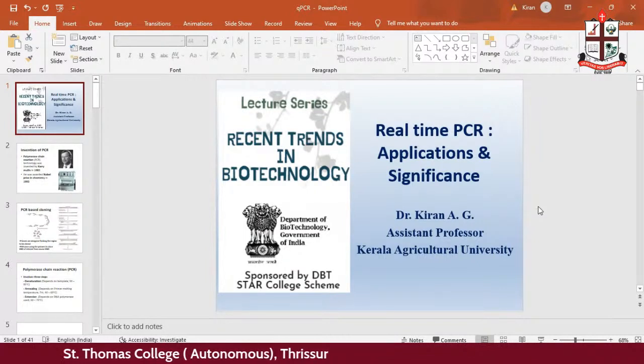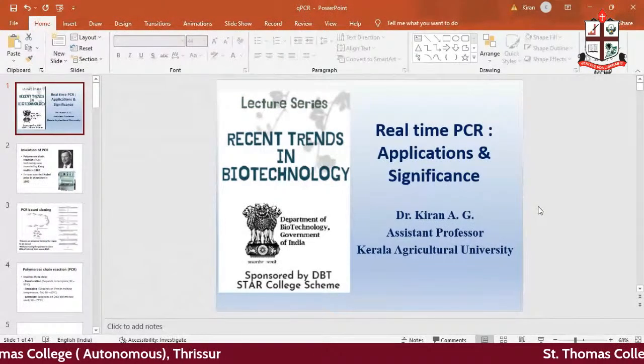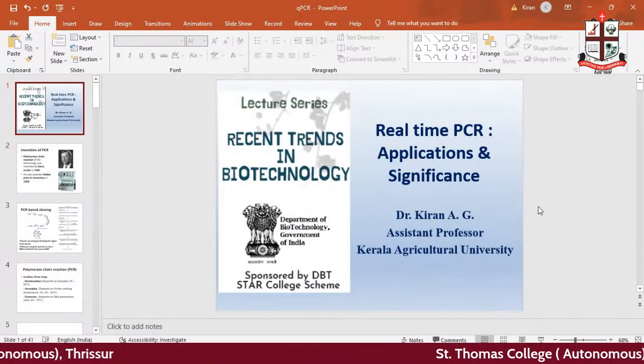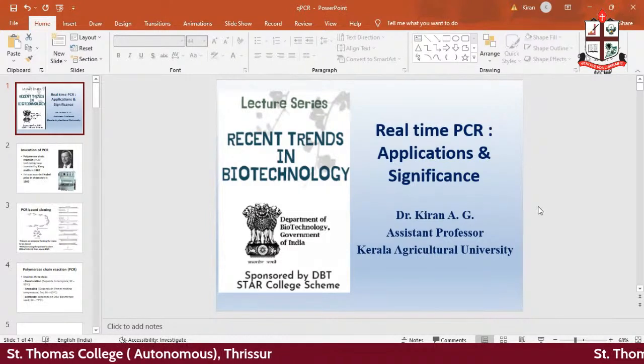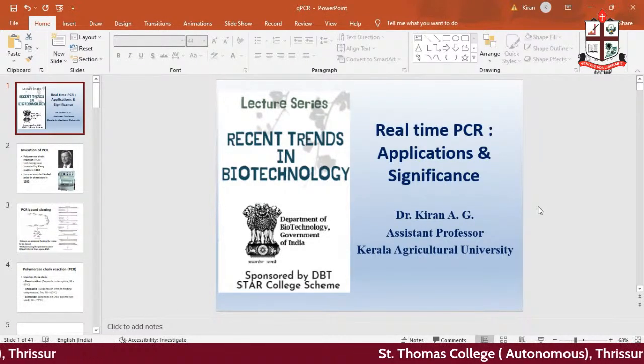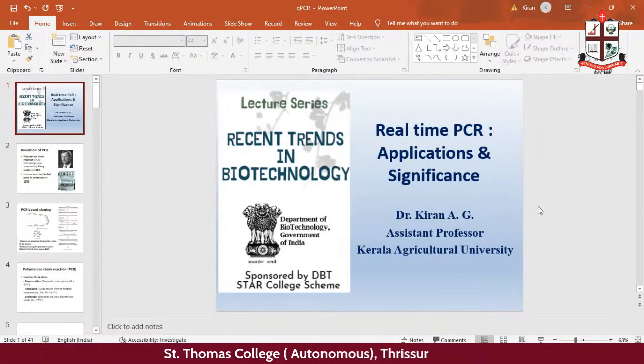So today I'll be discussing at length this application, that is, the application of real-time PCR for gene expression analysis. And I'll also be touching on other applications of real-time PCR like detection, molecular diagnostics, and also allelic discrimination. So I'll share my slides.